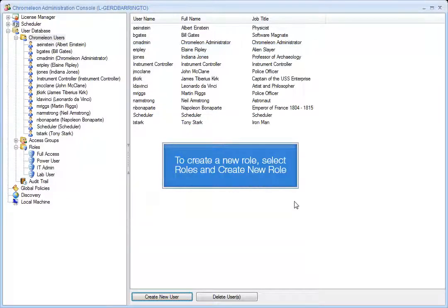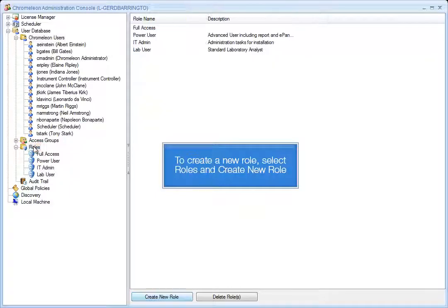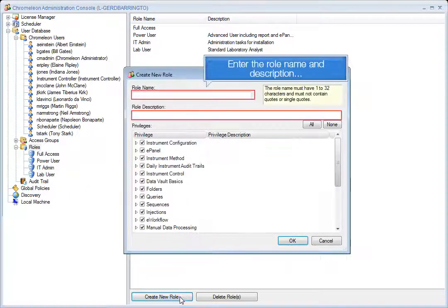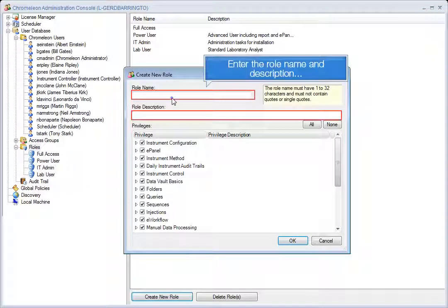To create a new role, select Roles, then Create New Role. Enter the role name and description.